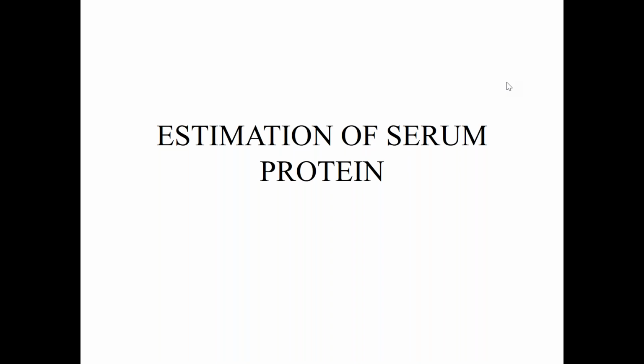So now I will be taking a briefing class on your practical topic, estimation of the serum protein. This is one of your main practical topics where you have to perform a colorimetry experiment to estimate the concentration of the serum protein in an unknown sample. Okay, this is important for your practical.